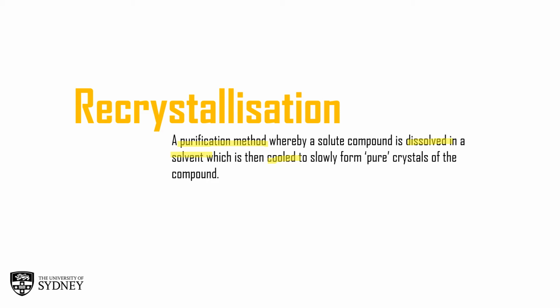So what is recrystallization? It's basically a purification method whereby a solute compound is dissolved into a solvent, which is then cooled slowly to form pure crystals of this compound. So we want to get these crystals.